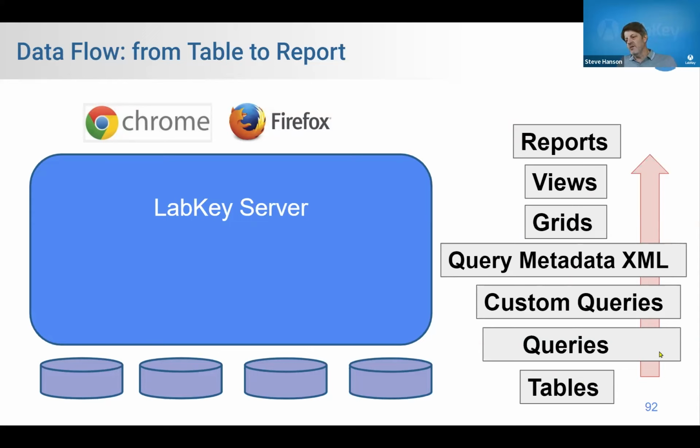Now that's a lot. I want to pause. See if there's any questions here. Yeah, we've got, are these sessions recorded, and where do I find those and training material? They are recorded. We're going to send them out next week. And you'll just get the email because you registered. You'll get the links because you registered. So that'll just happen for you. And I'll send you some other training materials as well, like tutorials, and check out the YouTube channel. There's a bunch of stuff on that.